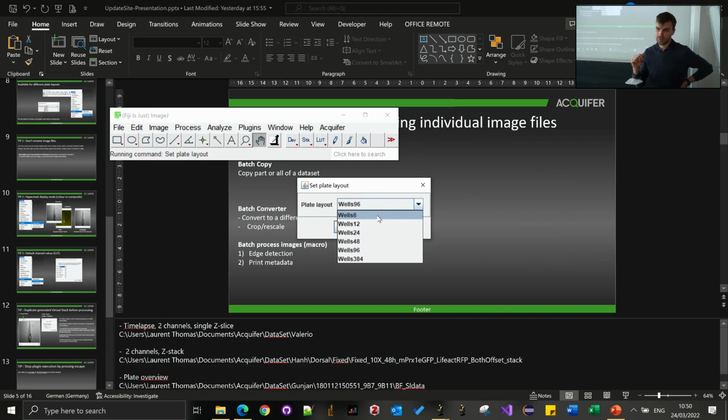But typically you have several different arrays on the plate. What they are mentioning is, if one is here and one is at this corner, then it won't be covered by this list, right? You can imagine the rectangle, and one is at this corner, one is at this corner, and another is in the middle. So you will get a lot of black space. You need a custom one, where you can customize and say, okay, I have this.